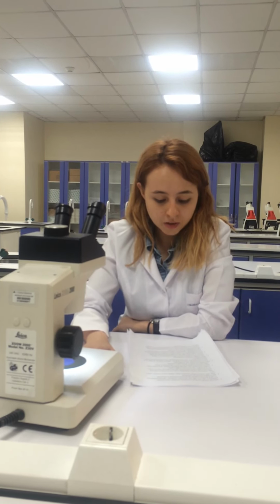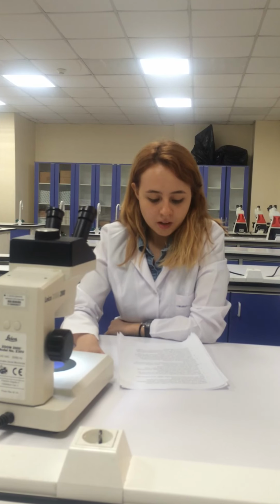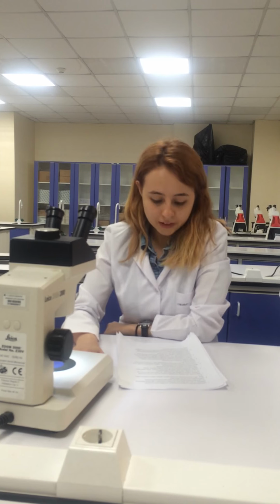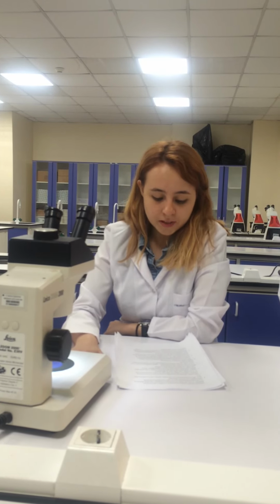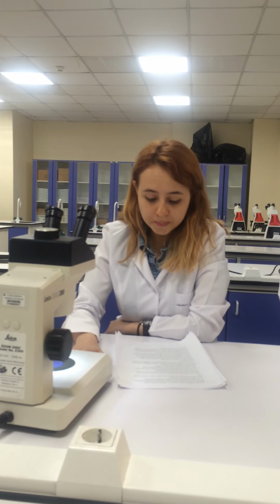After porcine adipose stem cells are seeded on 10 cm culture dishes for 24 hours, the culture medium is removed completely and the dishes are washed twice with PBS. PBS is phosphate buffered saline. Porcine adipose stem cells are trypsinized with 1 ml of 0.25% trypsin for 5 minutes and then neutralized with 1 ml culture medium.